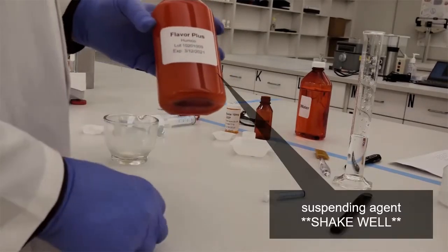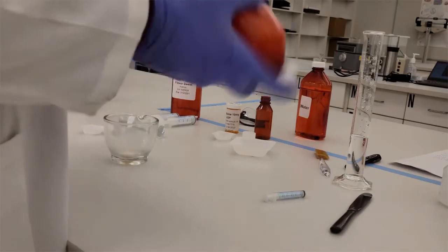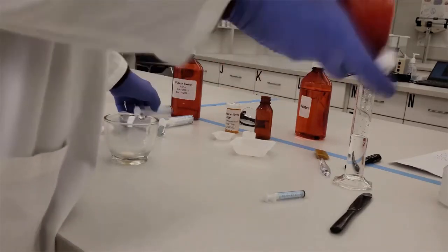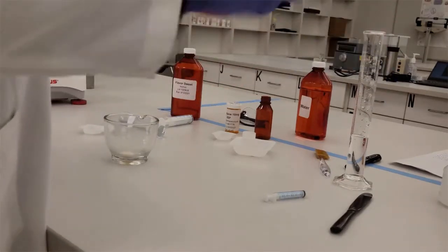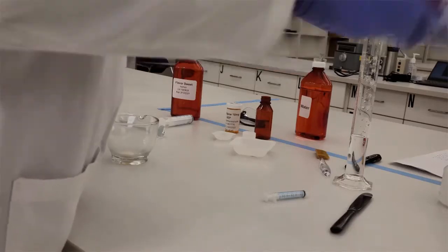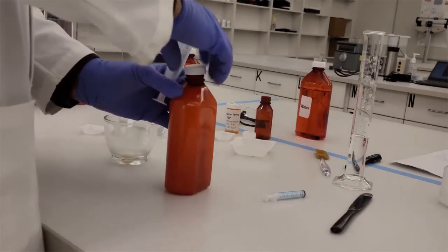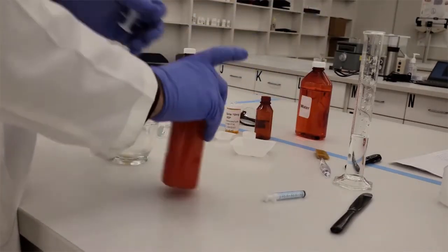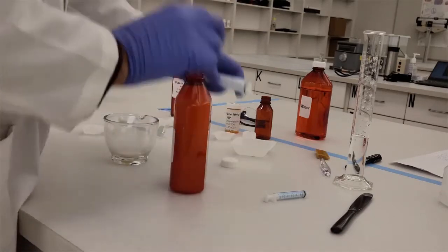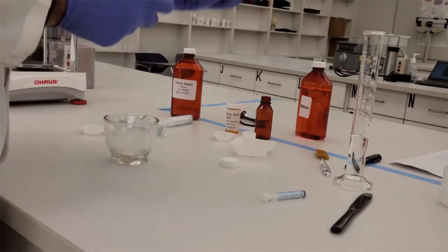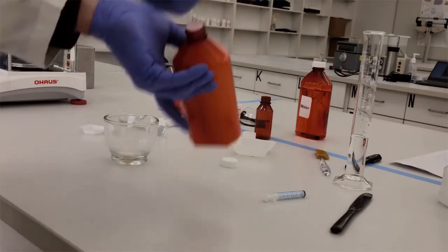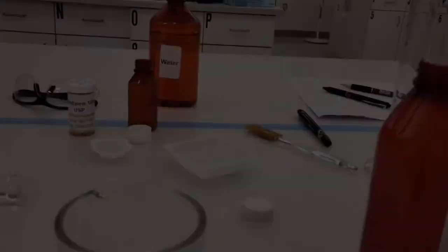So the first thing we're going to do is we're going to look for our suspending agent that you have in the lab. You're going to shake well because it's a thixotropic vehicle. So we're going to shake it well and you might as well shake it one more time for extra luck. And then we're going to use either an oral syringe or a graduated cylinder to measure out half of the volume you need. So I'm measuring mine 17.5 mLs.